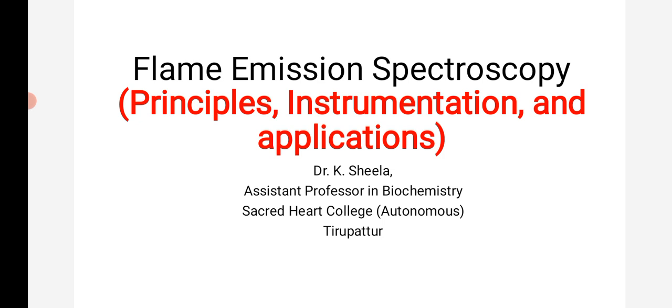Today we will discuss flame emission spectroscopy. Flame emission spectroscopy is one of the analytical techniques. It is most probably similar to the colorimetry instrument.